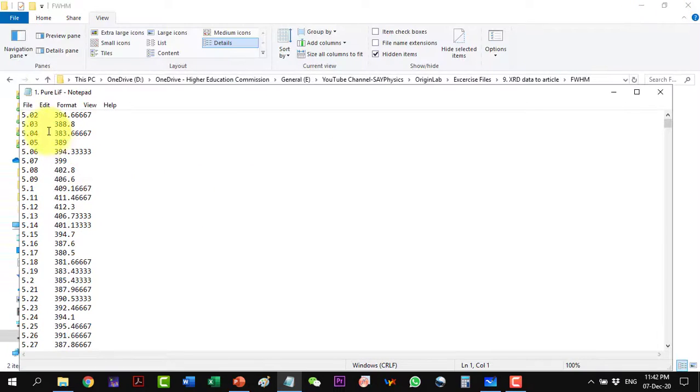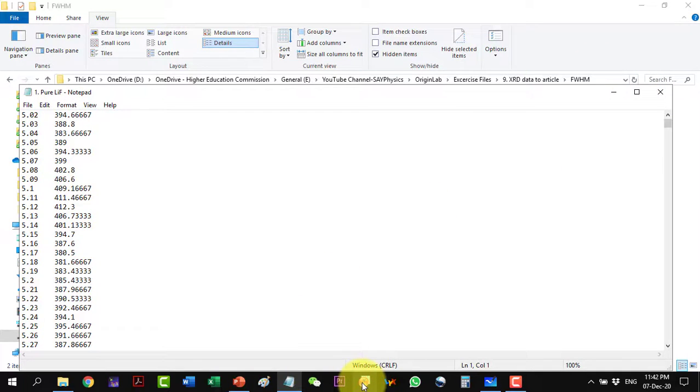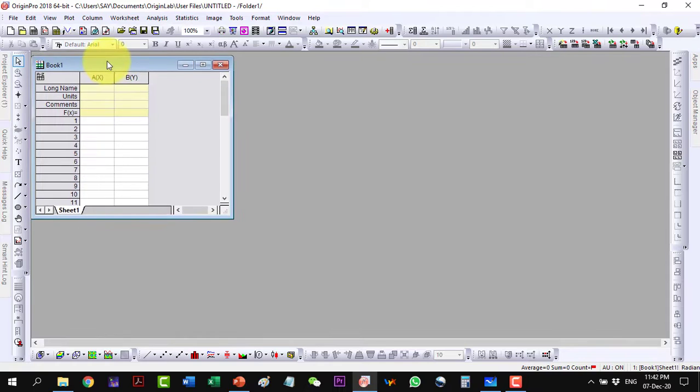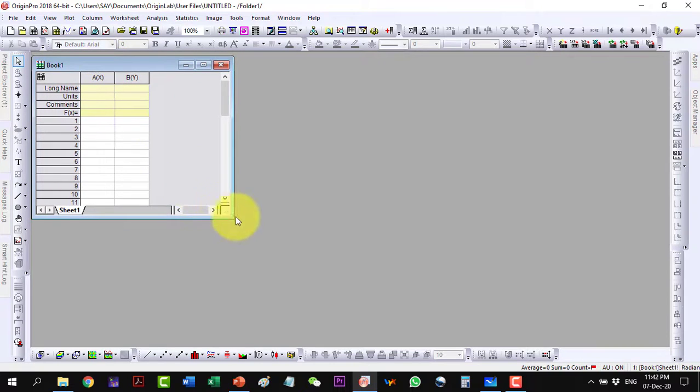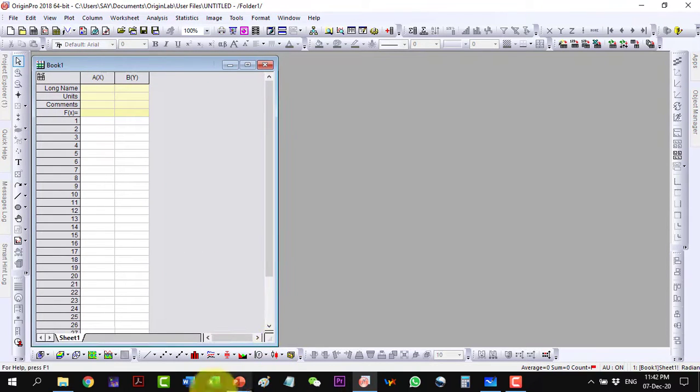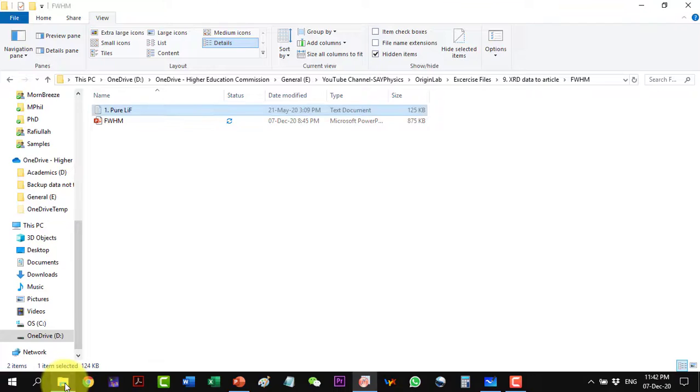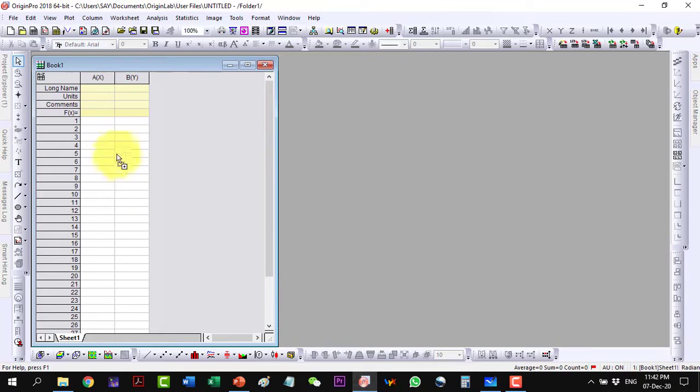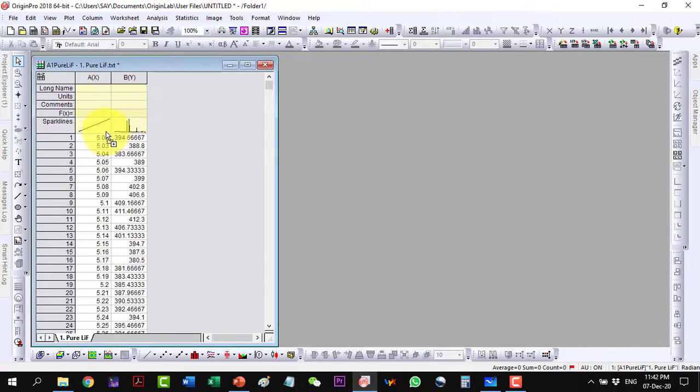Here we will start Origin. Here is our Book 1. I will import the data here and I do a direct drag and drop here. The data will come here.